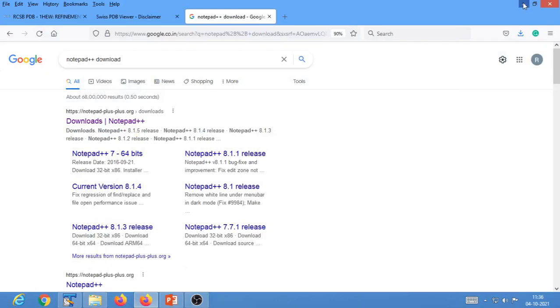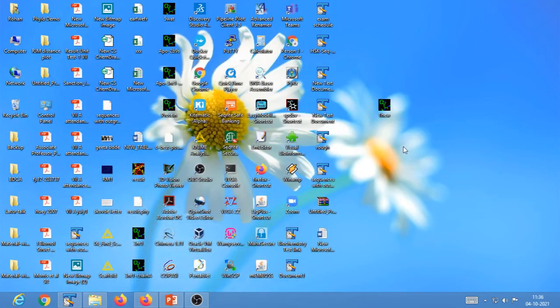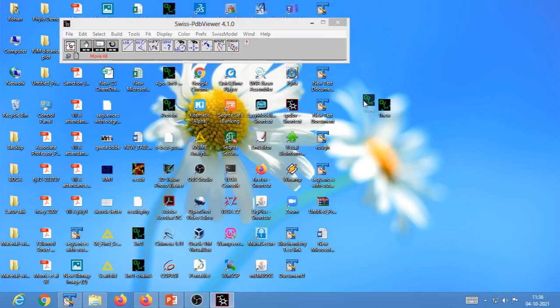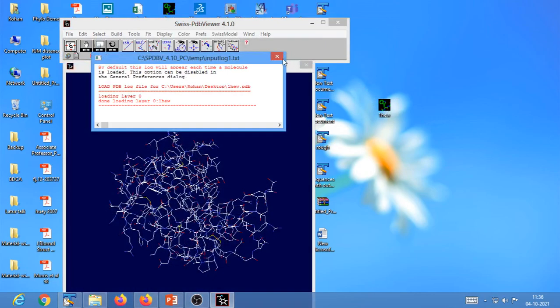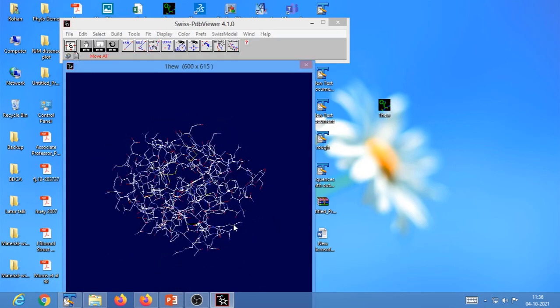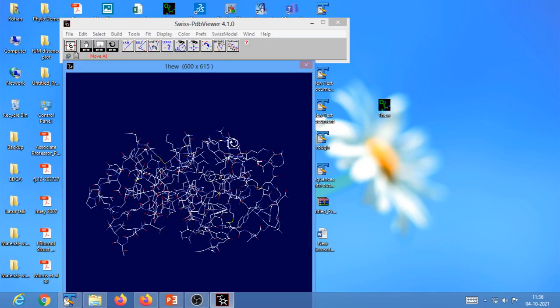One way to see what is provided in your PDB file is to directly visualize it in any protein structure visualizer. For example, in this case, we are visualizing the protein molecule in SPDBV.